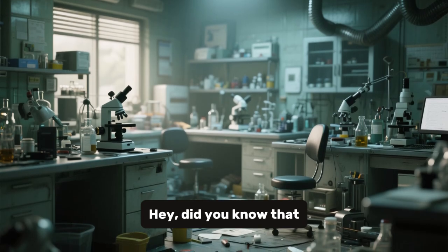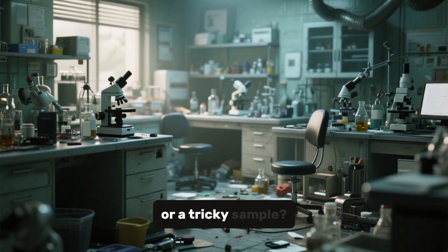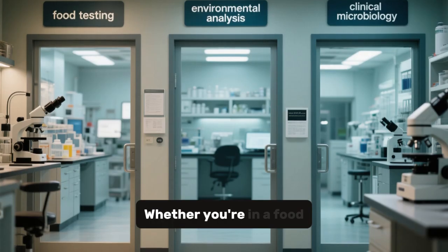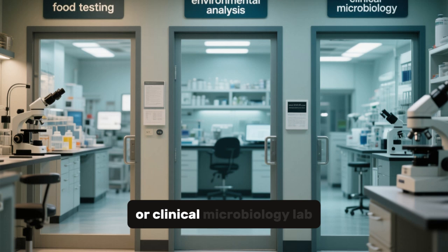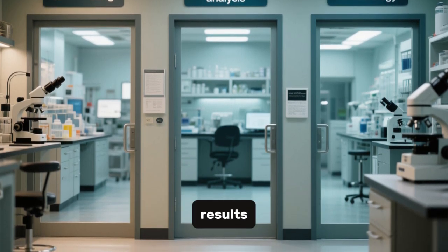Hey, did you know that one of the biggest risks in any laboratory isn't complex instrument failure or a tricky sample? It's something much simpler: the layout of the lab itself. Whether you're in a food testing, environmental analysis, or clinical microbiology lab, how you organize your space can make or break the integrity of your results.